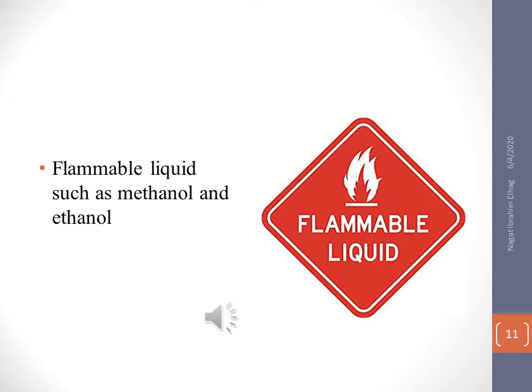One of the hazards that usually occurs from time to time in a chemical laboratory is due to flammable liquid reagents, which may cause risk or danger to the lab workers.